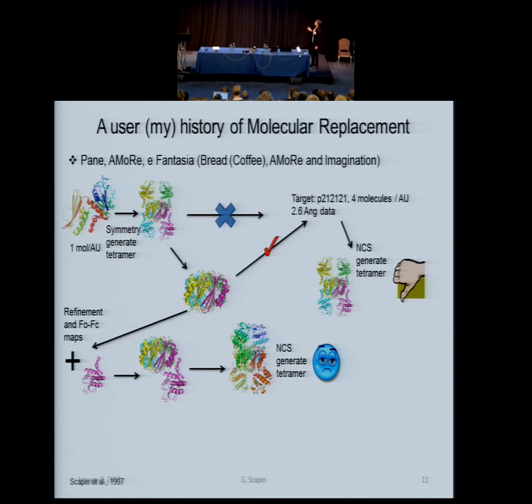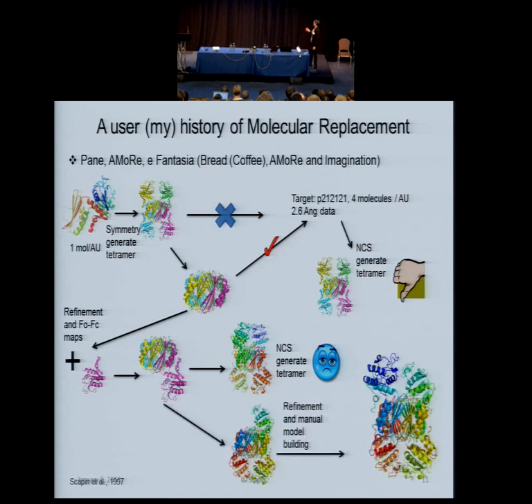And in this case, there was only one domain that was really badly positioned, so I removed that, I did a refinement. And then eventually I managed to position it by hand. And what it turned out is that, of course, of the 4 molecules, 3 domains were closed, the 4th one was open. And 3 were completely occupied by ligands, the 4th one wasn't.